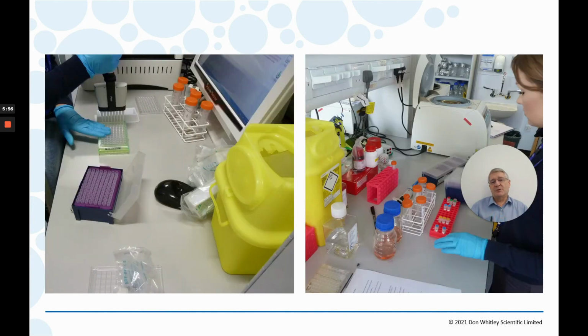Let me give you an example. A few years ago, also at the University of Manchester, we were approached to see whether we could either supply from existing product ranges or to design a new one, a workstation that would accommodate an extracellular flux analyzer. It became apparent that none of the products we then had would be entirely suitable, and we began to seek to understand what the requirements were in order to accommodate a device of this kind.